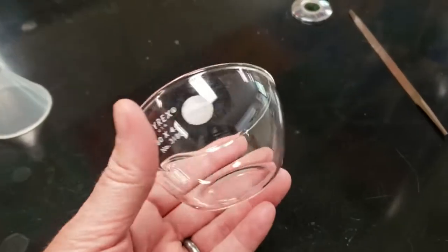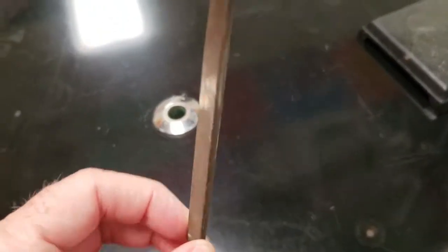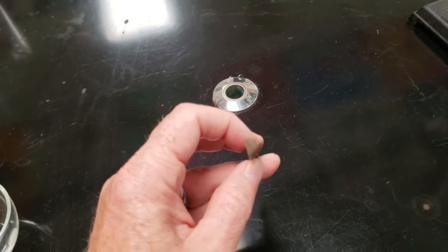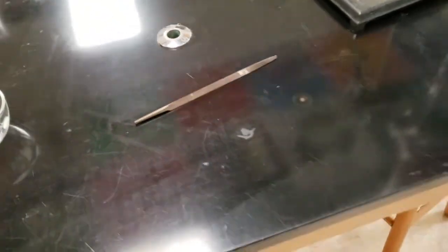This is an evaporating dish. It's a Pyrex one, or a glass one. You can heat these up. This is a triangular file. It's called that because it's a file and it's triangular. It's good for scoring glass tubing, and you can snap it on the edge of the table and then fire polish it and create all sorts of glassware you need.